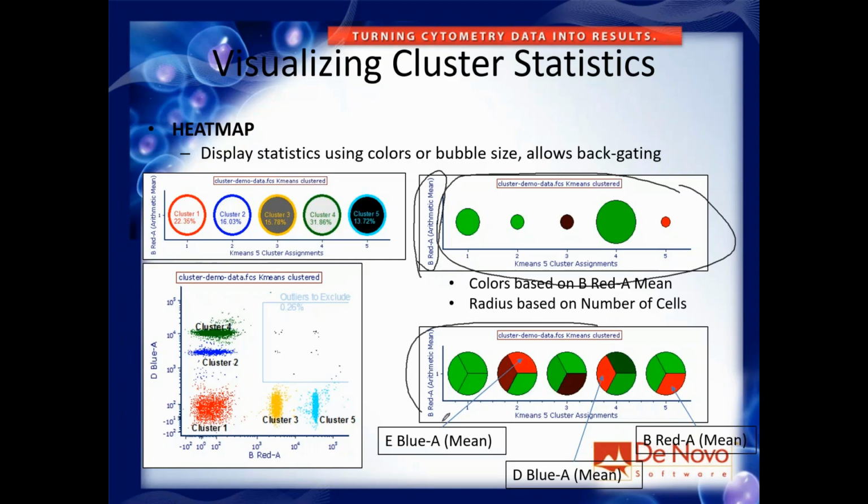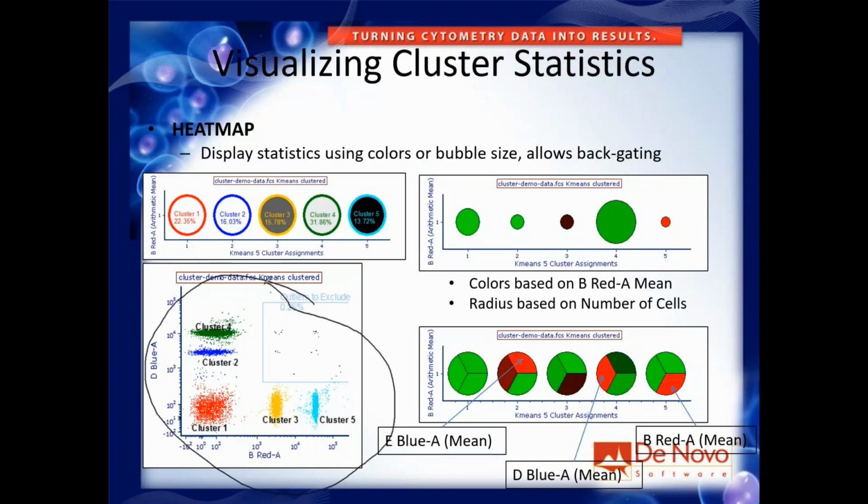And you can also look at clustering where, for each cluster, you can get a couple of different statistics in sort of a Trivial Pursuit pie slice type thing, where each pie slice is a different statistic. So there's various ways of trying to understand what the clusters mean, but really, at the end of the day, most likely going back to your dot plot and looking at the different clusters across the different populations is the best and most critical way of doing that. Okay?